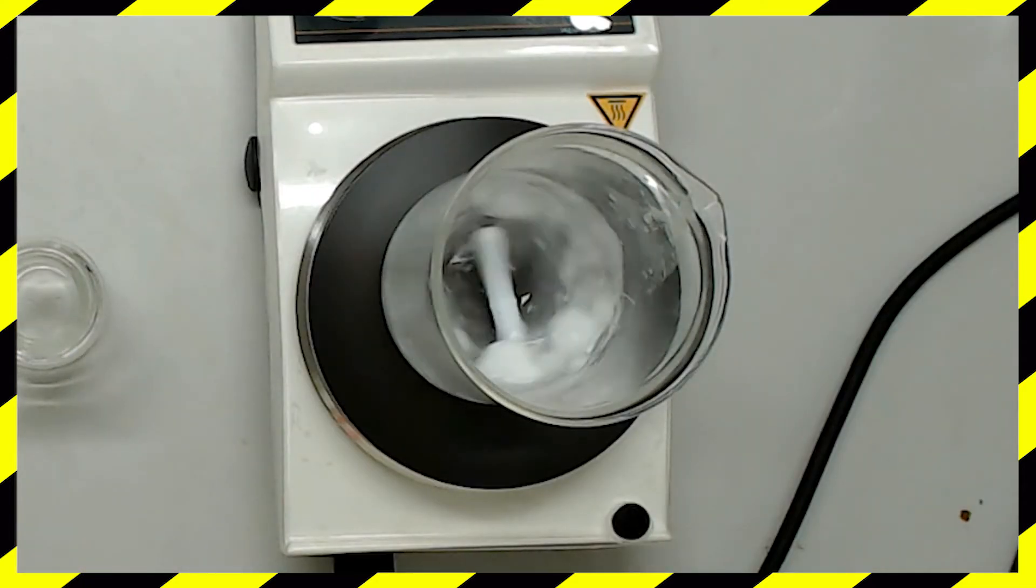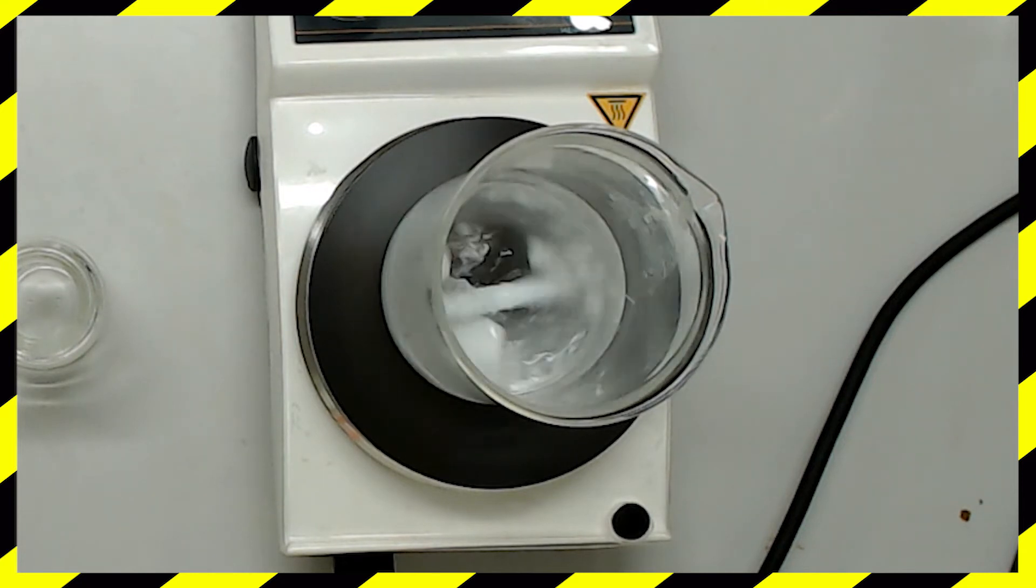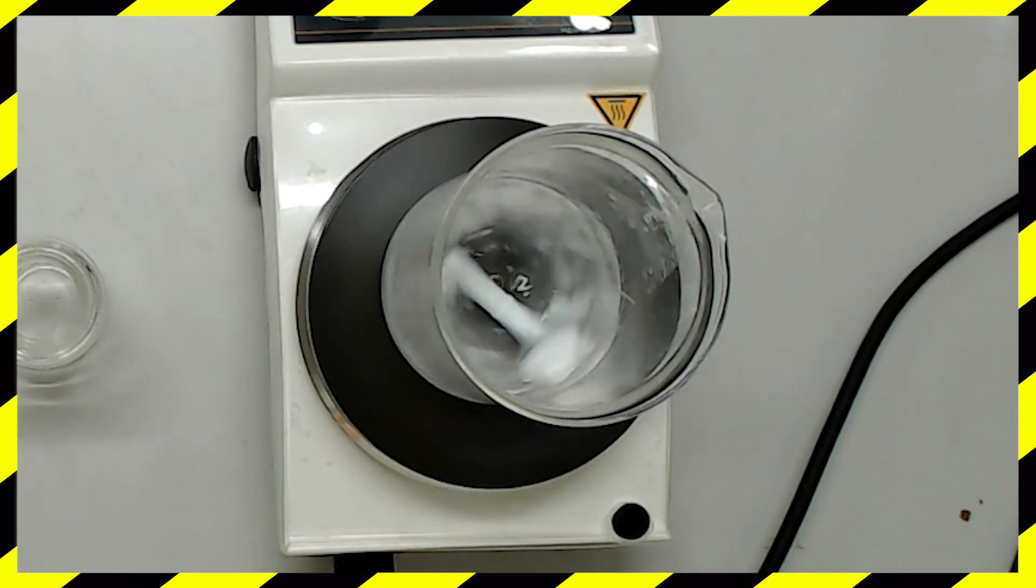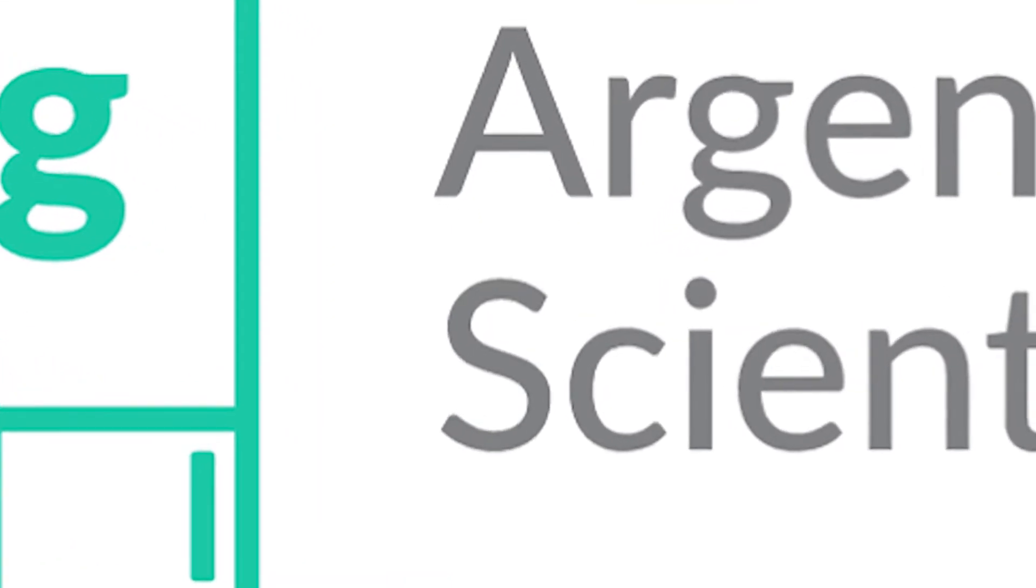I did this once without a heated stirrer and I think it took me about 3 hours to coax the last bits of salt to dissolve. Luckily our sister company has trusted me with their equipment for the day. Shout out to Argent Scientific, your one stop shop for niche chemical needs, shipping globally.